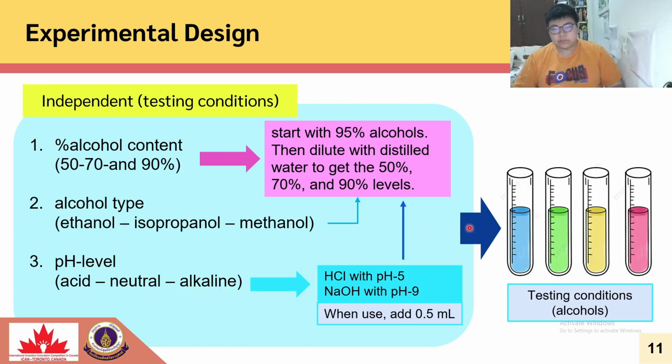The alcohol conditions were later tested with 3 types of reagents. Each type was made using the extracted anthraquinone, confirmed to be damnacanthal. We dissolved it in 3 solvents, including dichloromethane, dioxane, and acetonitrile. By adding the reagent to alcohol conditions, here are the results.